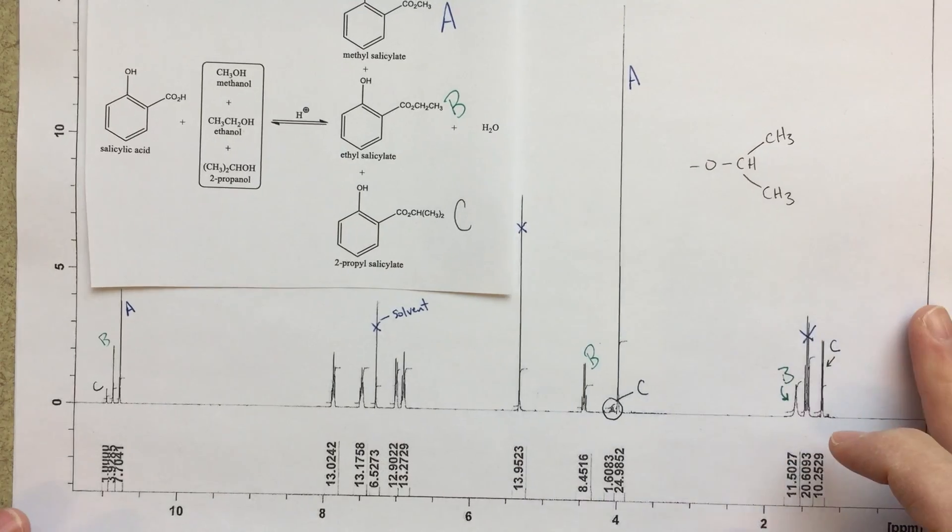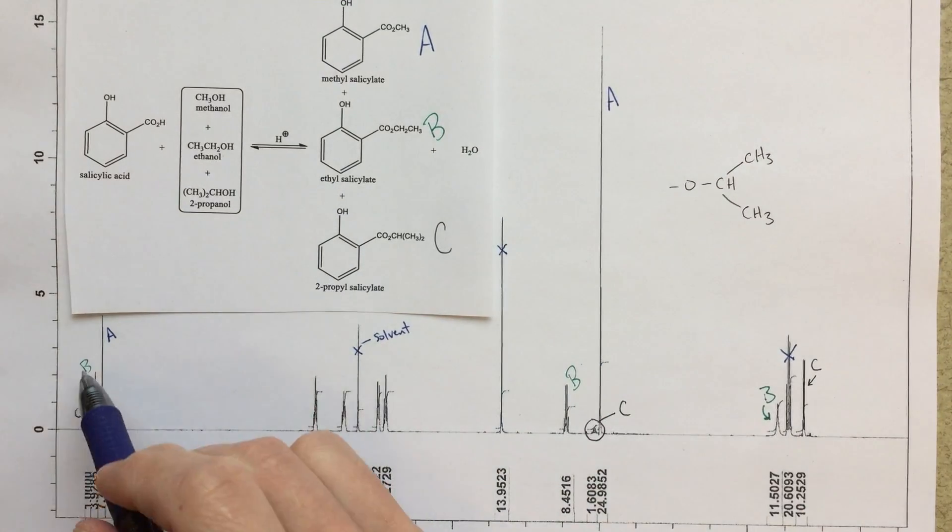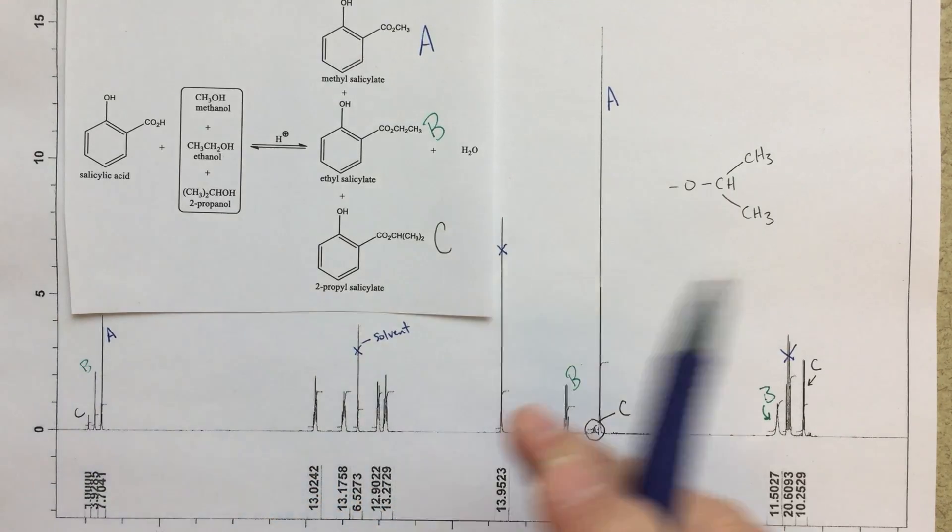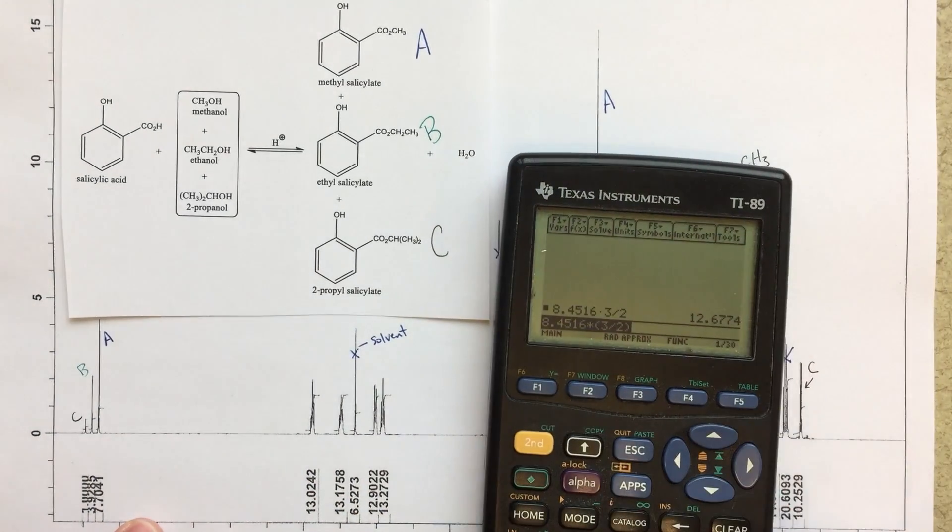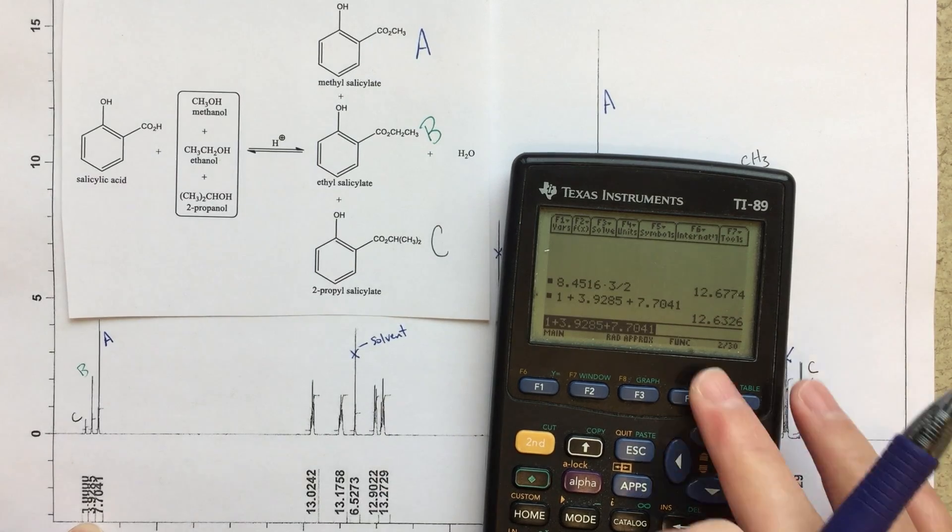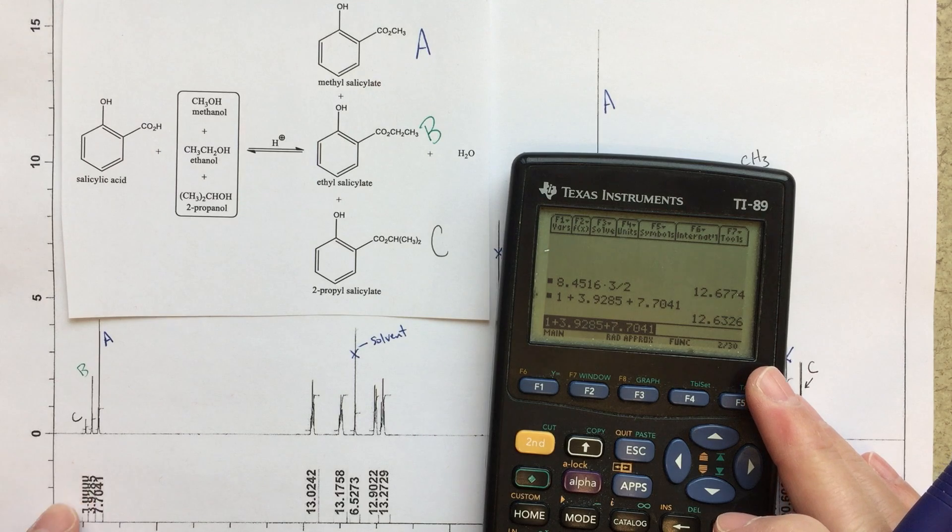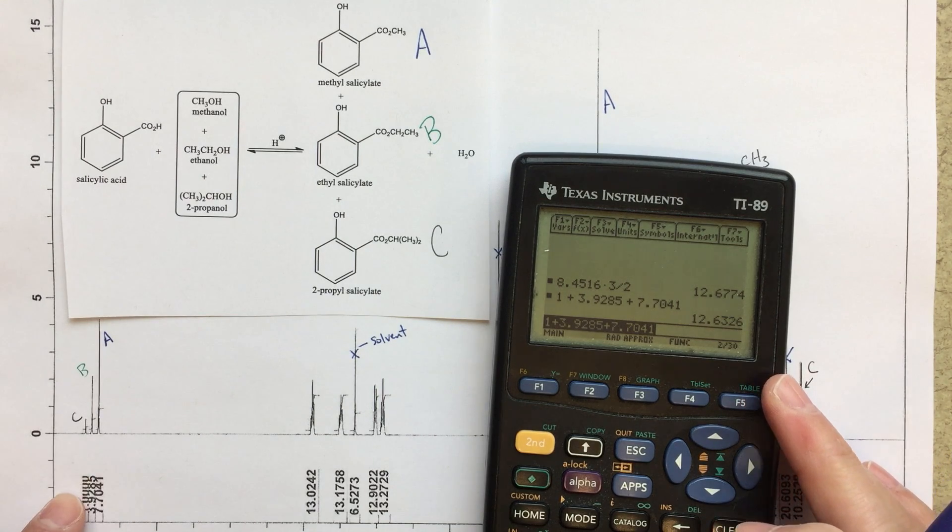And the way that I would do that is I would add up the integrals for all of my species. So 1 plus 3.9285 plus 7.7041 gives us 12.63. That 12.63, that's sort of the sum, the total for all of these integrals.